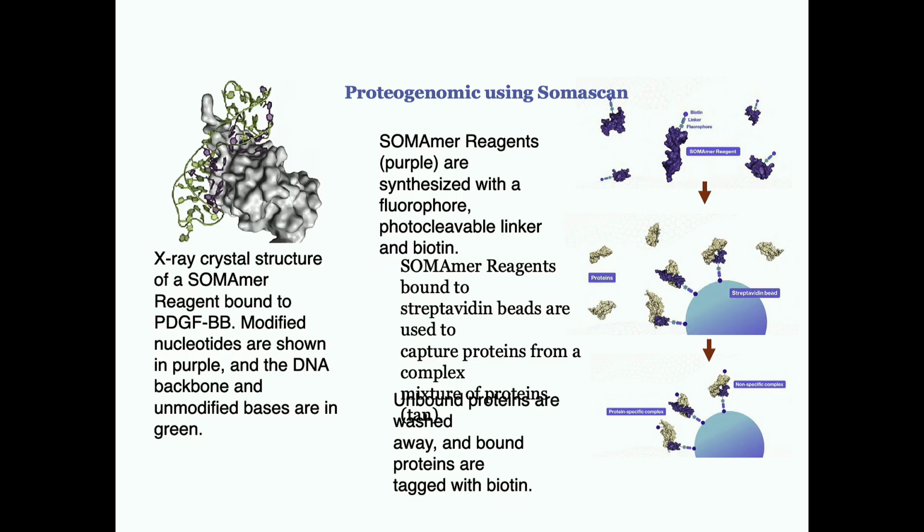I mean, you can't do cell lysate with SomaLogic, but with Olink you can do that. So protein will go and bind to its specific aptamers, which are immobilized on streptavidin beads. Now you pull everything out and wash off any protein that is not bound, and now you have a very specific aptamer interacting with protein, with all the linkers and those kinds of things.